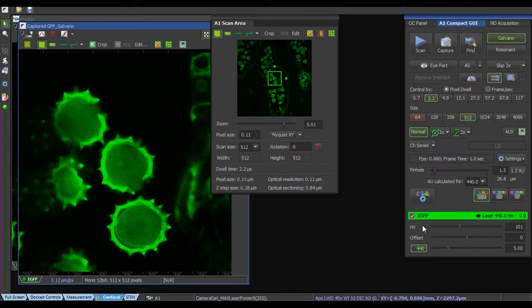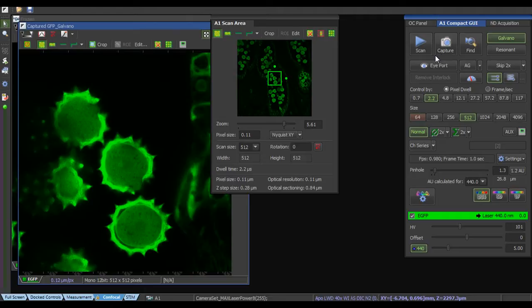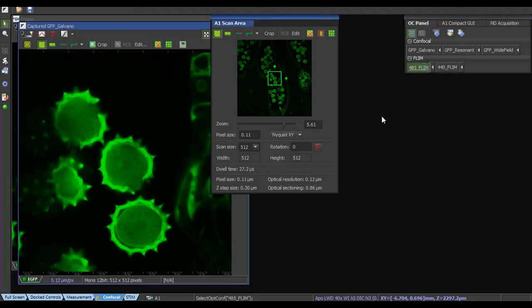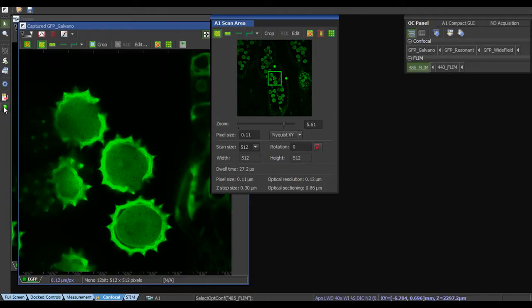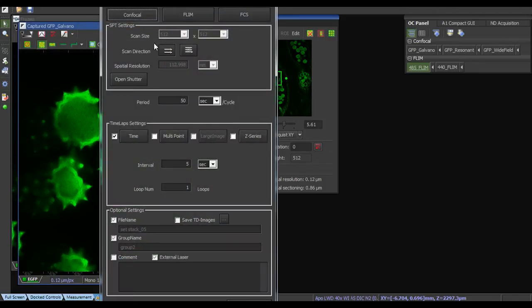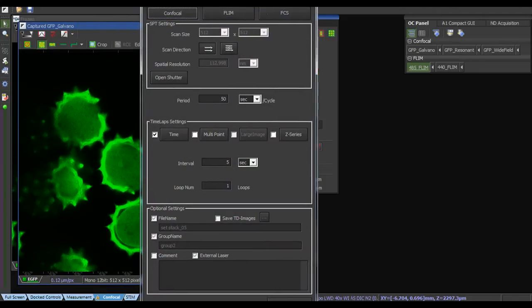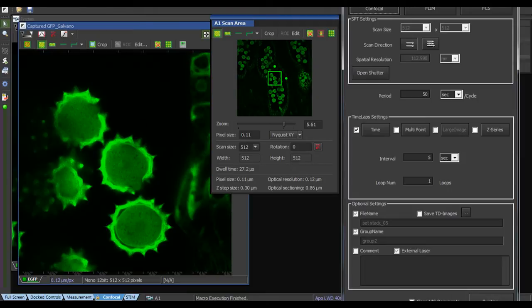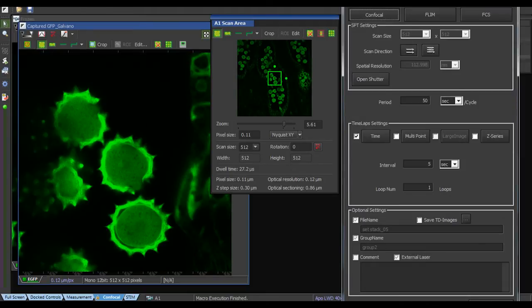Okay, so I think I will go for the 485. Very recently between Nikon and PicoQuant we have developed a third software which we call at the moment macro plugin which is here in this green icon. This software is able to read the settings of the confocal microscope and transfer those settings to the SymPhoTime software. At the same time this macro plugin also makes the acquisition a lot easier.